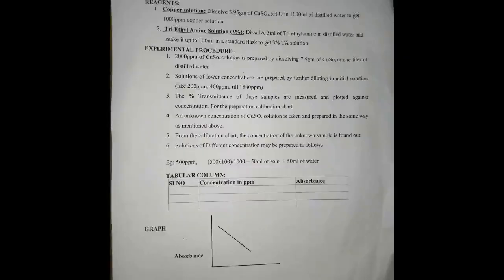Then you prepare the unknown. The unknown solution, the given solution, you have to take it and find out the absorbance or transmittance. The respective values you have to plot in the graph, and from the graph you can find out how much ppm is present in the given solution. The final results are put in ppm or mg per liter, the concentration of the given sample.